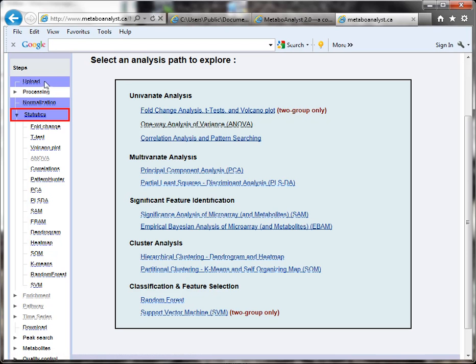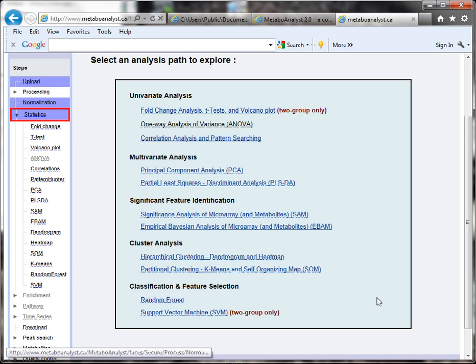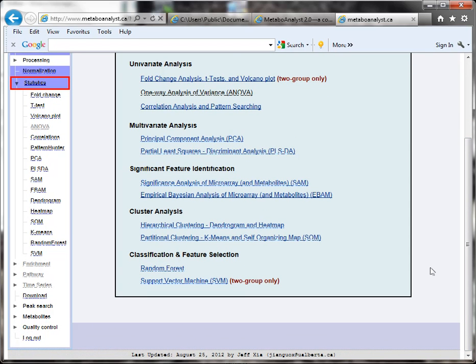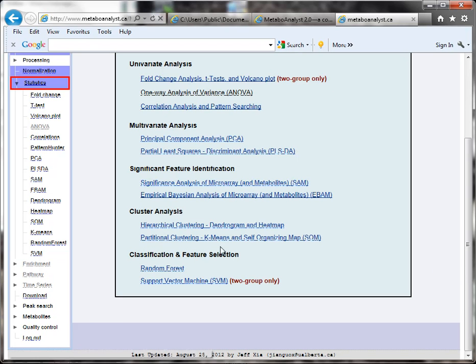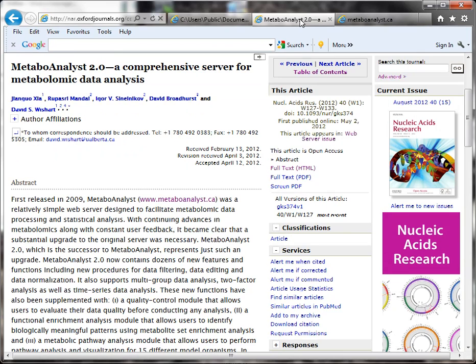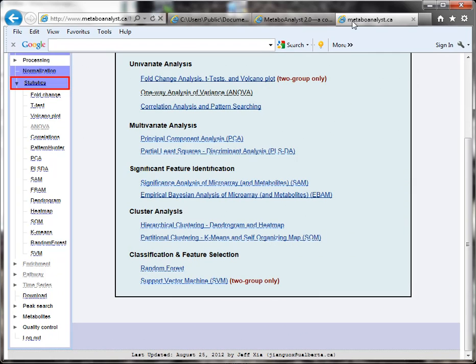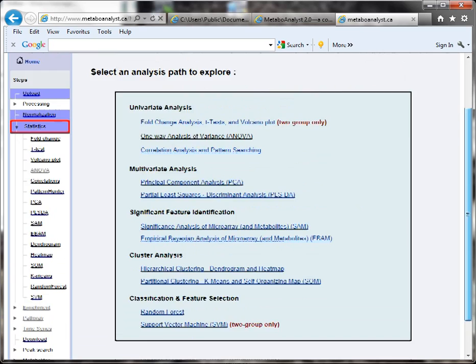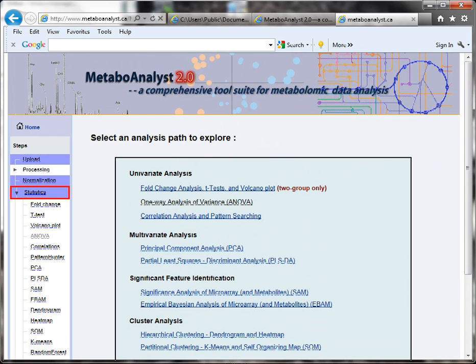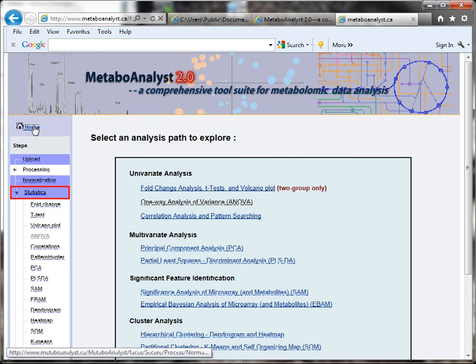So we uploaded, processed, and normalized. Now we can do statistics and other analyses, including enrichment pathway analysis, time series, download our data, and peak search. The paper that I showed you is very well written and explains the tool. As I said, the interface is very intuitive. They have a lot of tutorials as well.